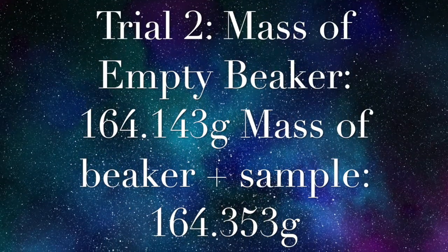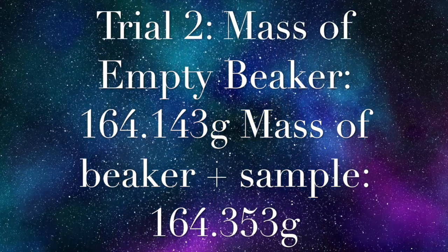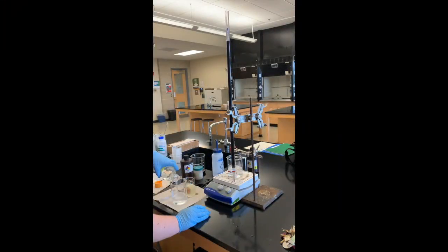I'm going to go ahead and add the acid to the other two trials for Part B as well. You can calculate how much sodium oxalate has been used from the information in the PowerPoint. When I add the acid to the beaker that has the oxalate in it, I'm also going to add a stir bar. Once our first titration is finished we'll start heating up the next sample.